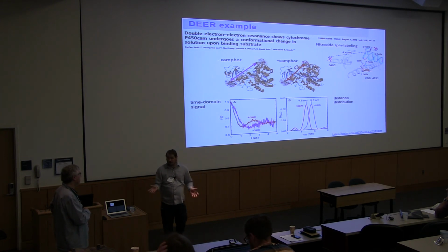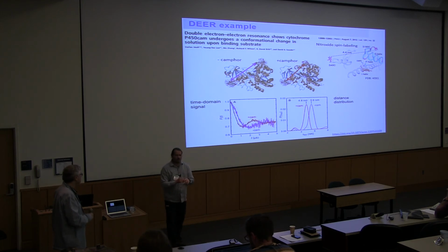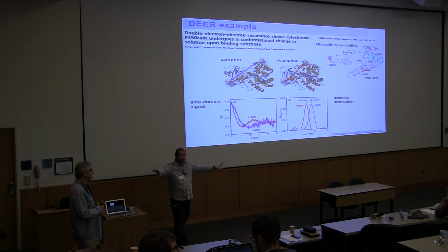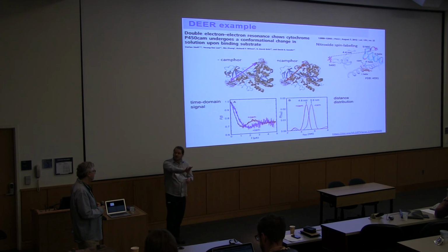For MIMS ENDOR, things are a little bit more tricky. What you have, you create a grating of polarization. As we have precession of spins, they will be affected by nuclear resonances, and this will evolve as well. And if you pause at different times, you either create nuclear polarization that you can affect by an RF pulse, or you cannot. And this goes in a circle. So for some couplings you will see an ENDOR effect, for some you don't, and it goes back and forth. And that will depend on how long you wait between the pulses. So that's the short answer.